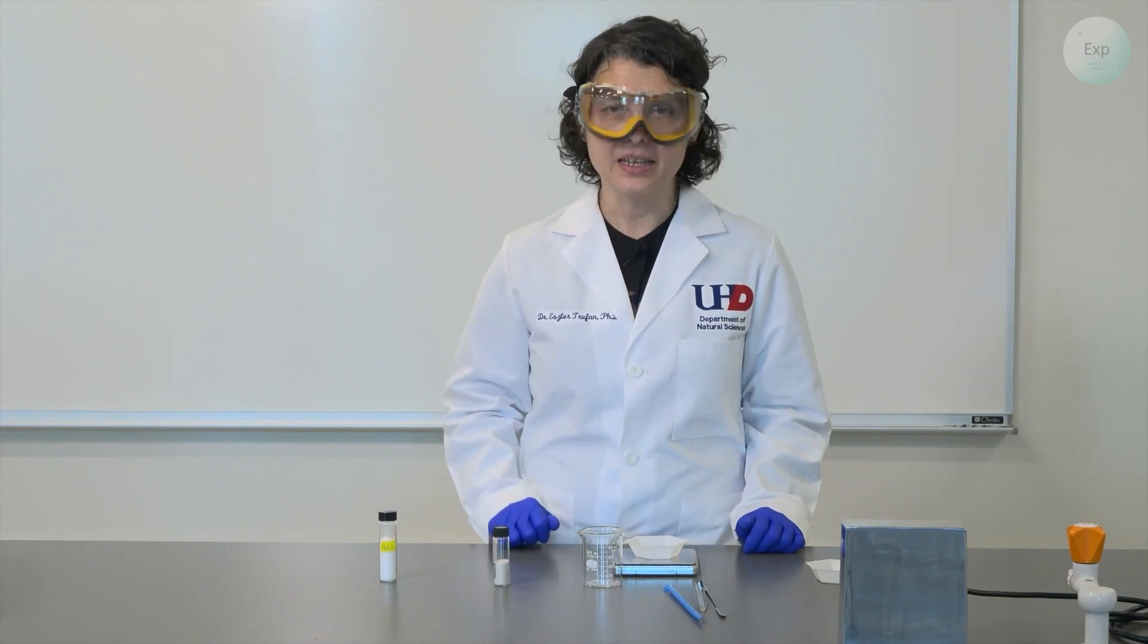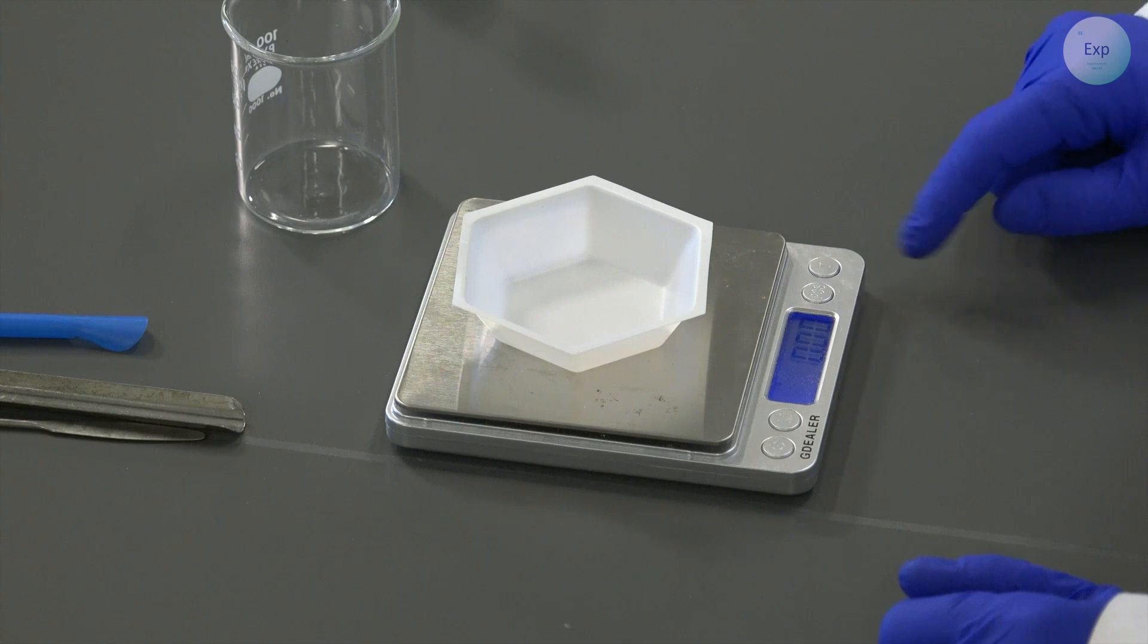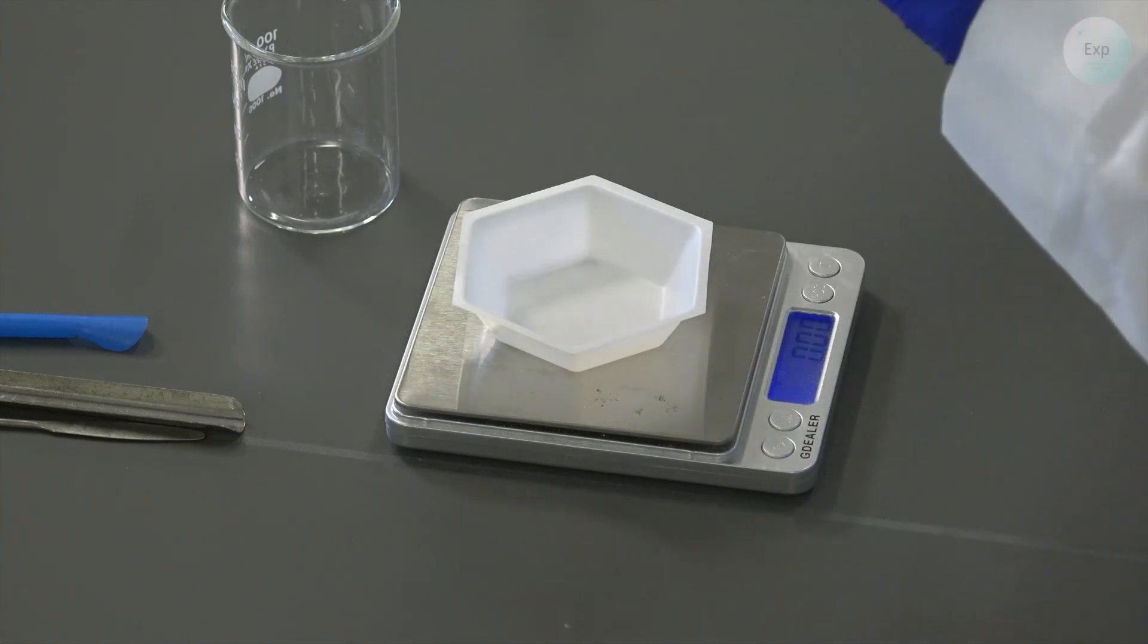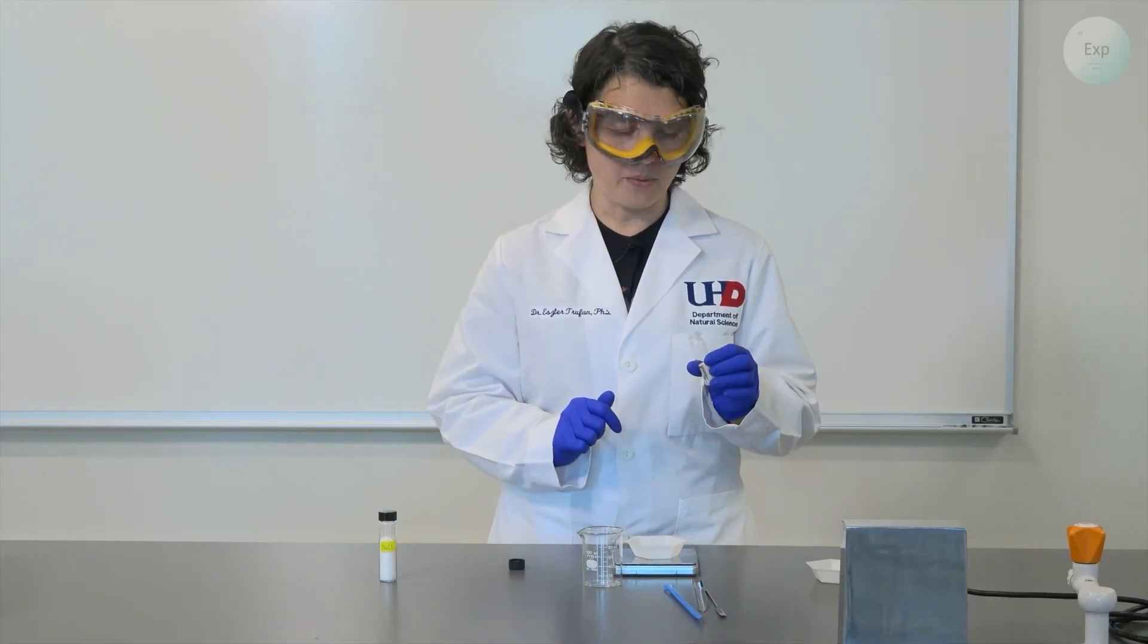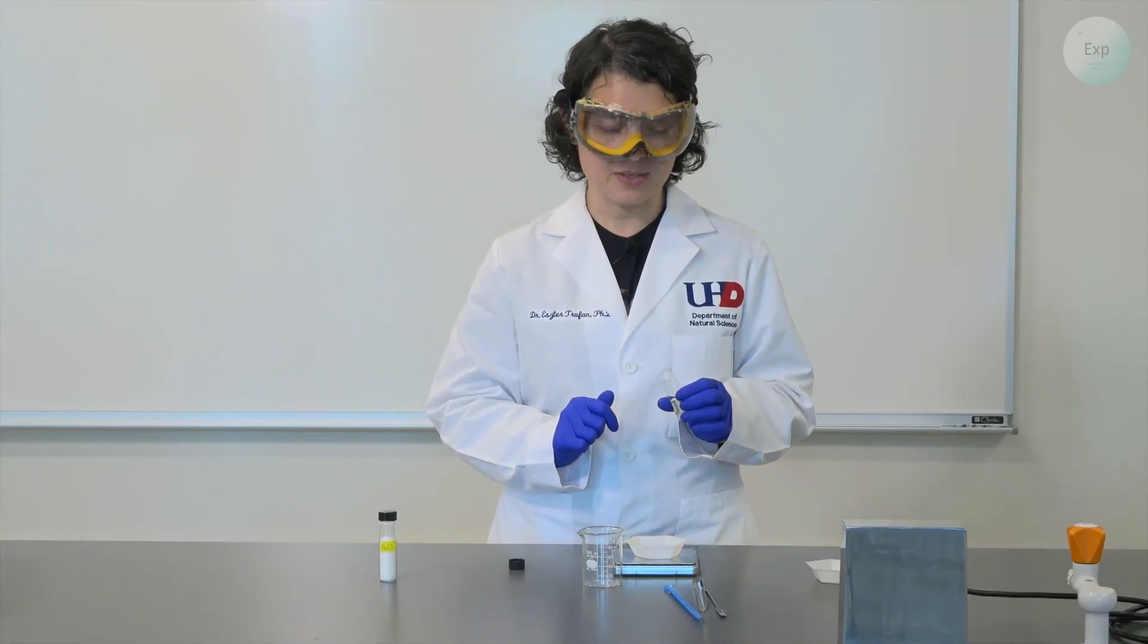The next thing I'm going to do is place my second weighing boat on the scale, tare it, and then use either a different spatula or the original spatula after it has been cleaned and dried to weigh out approximately five grams of the sand.